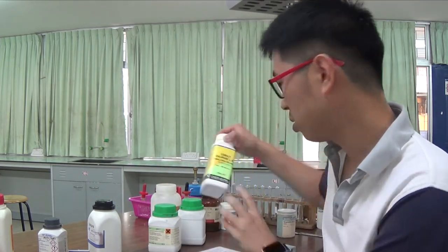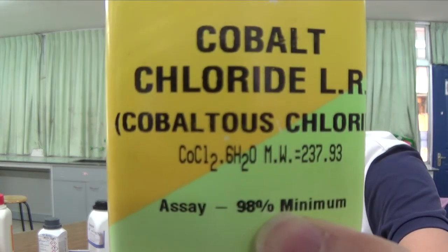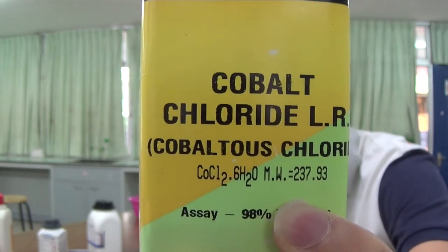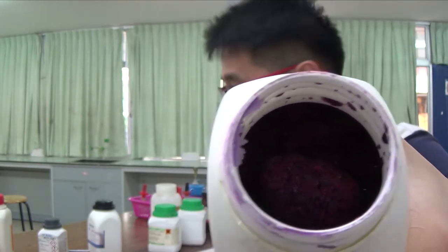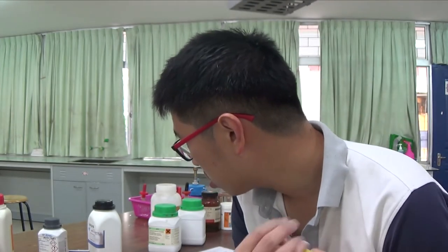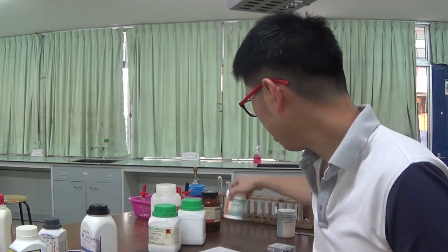Right? And of course, we also have cobalt chloride, CoCl2.6H2O. The molecular mass is given there. Cobalt forms very colorful compounds again, transition metal compounds. This looks a bit pinkish, not too sure it's very clear on the screen. Just now was cobalt(II) nitrate. This is cobalt(II) chloride.